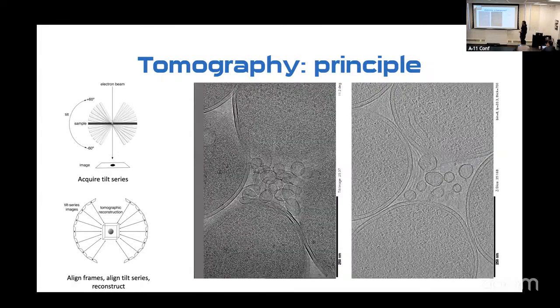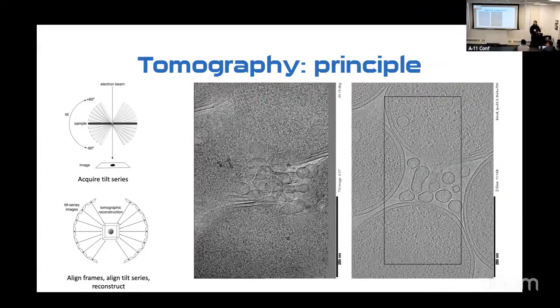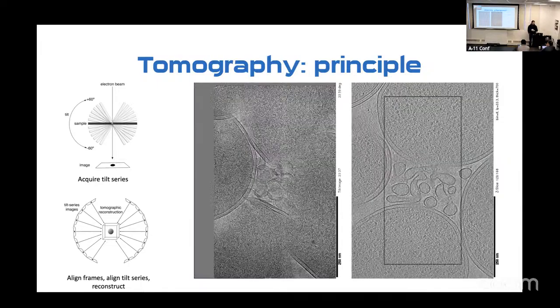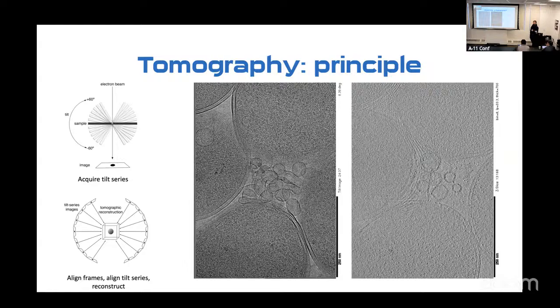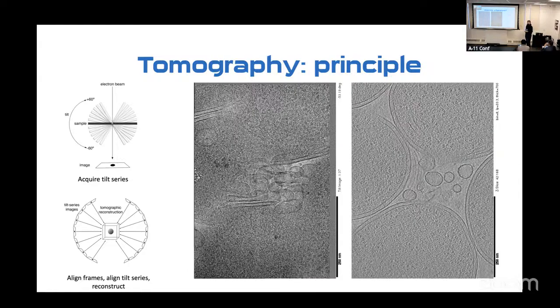We want to get the thing on the right. The left is the flat images, we call it tilt series, the series of tilts, and on the right is a reconstruction, which is the back projected tilt series images. And I'm saying this is an intermediate goal because you have to get this. Until you get this, you cannot do anything else in tomography. But data processing, this is just the very, very beginning.